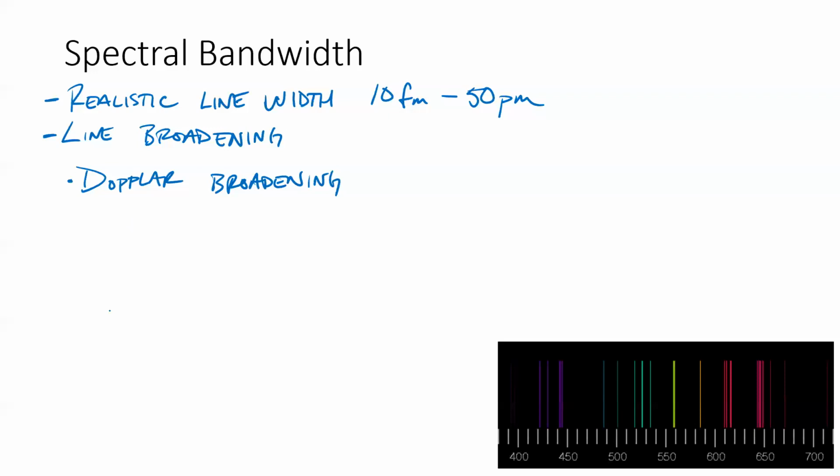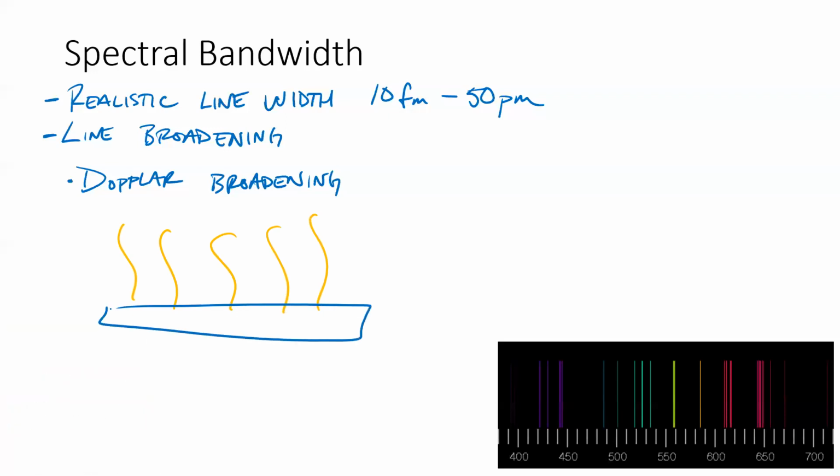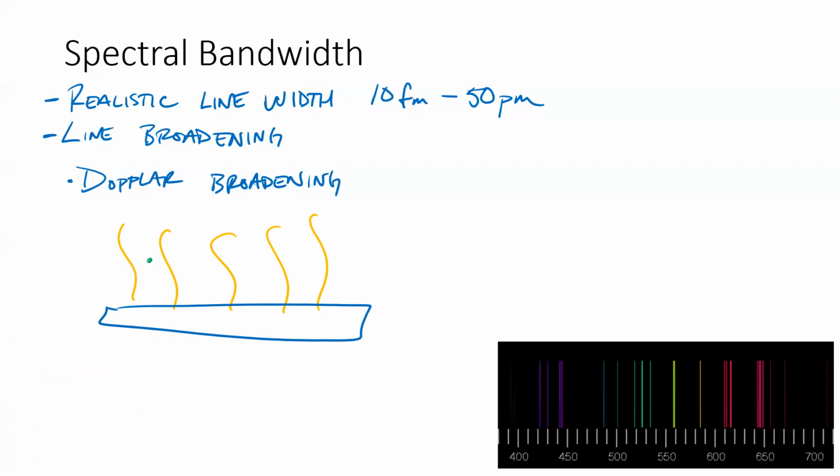And so this Doppler broadening, again, if I've got my flame, here in my flame, I've got a green sample atom, and I've got my light coming in. So this is my light from my source. If the light source and the atom are moving toward one another versus moving away from one another, or in the same direction, I should say.